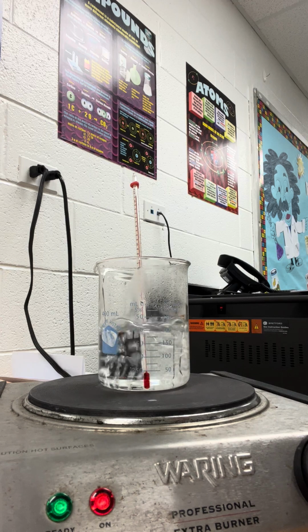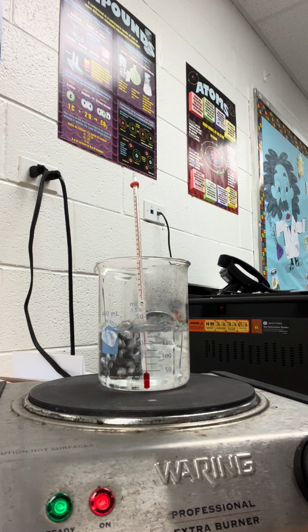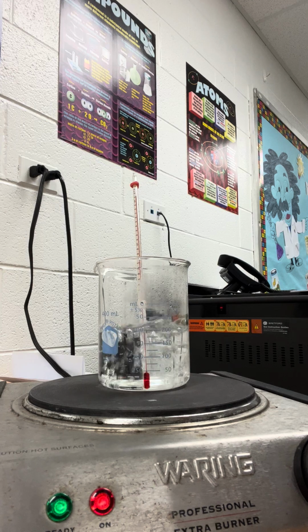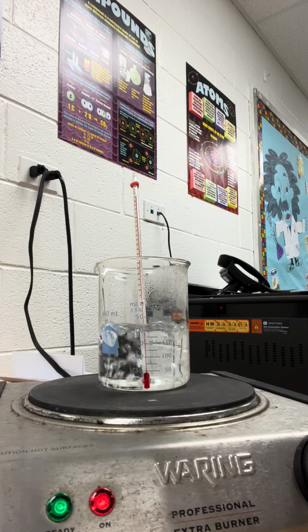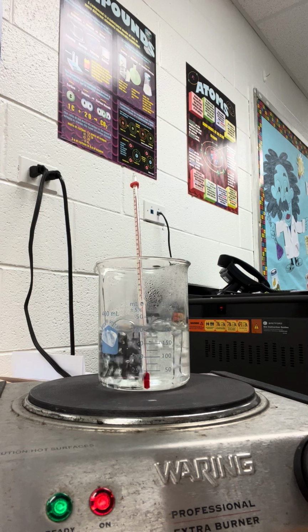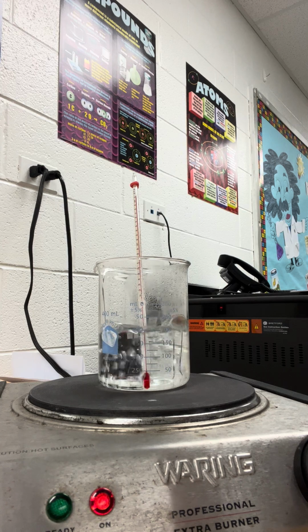So our temperature is right at 102 degrees Celsius. And we'll let it run for a little bit longer to show you guys that even after 30 more seconds, it's still going to be at 102 degrees Celsius because we're still undergoing that phase change. Eventually afterwards, we might see an increase if we had more power or more heat. But due to the hot plate only getting so hot, we will only see the temperature increase to what it is at now, at 102 degrees Celsius.